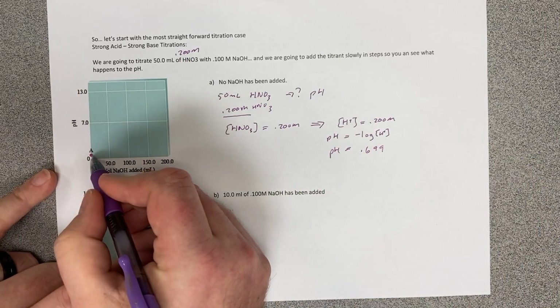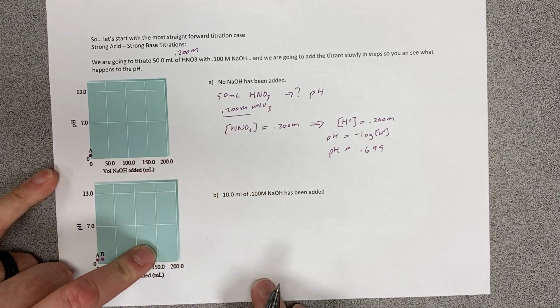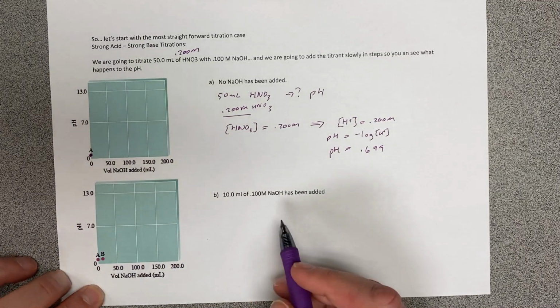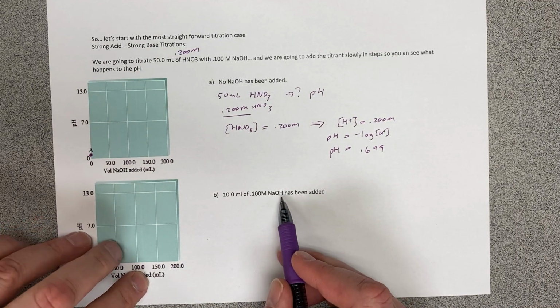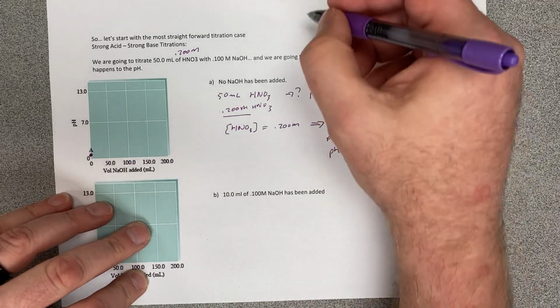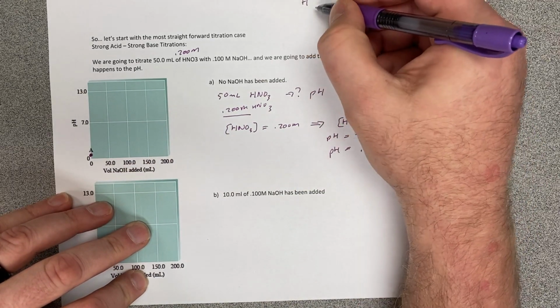And we've plotted that on the graph over here. You can see that is our starting point. Now, what we're going to do is continuously add different amounts of NaOH to our HNO3. And one of the things that you need to be aware of is what we're actually doing up here. I'm going to put it at the top of my notes.